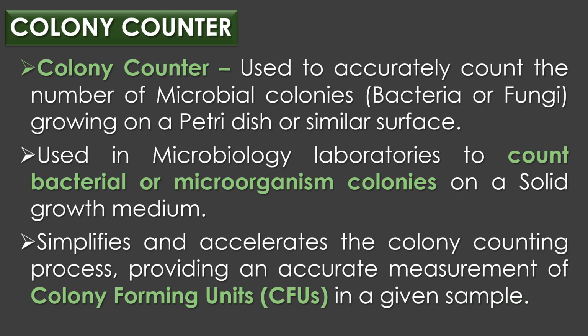Colony counter. A colony counter is a laboratory instrument used to accurately count the number of microbial colonies, either bacteria or fungi, growing on a petri dish or similar surface. A colony counter is a device used in microbiology laboratories to count bacterial or microorganism colonies which are grown on a solid growth medium. It simplifies and accelerates the colony counting process, providing an accurate measurement of colony forming units or CFUs in a given sample.